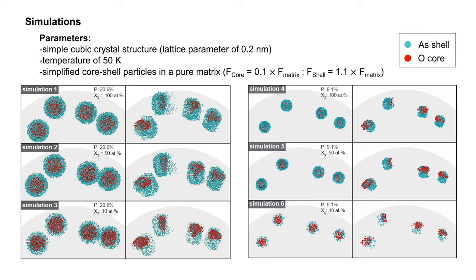Regardless of the parameters, all 6 simulations reveal similar results. The pre-evaporation spherical shells mostly retain their morphology after evaporation and only appear to have a slightly dispersed arrangement of ions. And the initially spherical simulated cores consistently produce dense and irregular ion clusters amalgamated into disc-like geometries at the tip or at the edge of the post-evaporation shells.